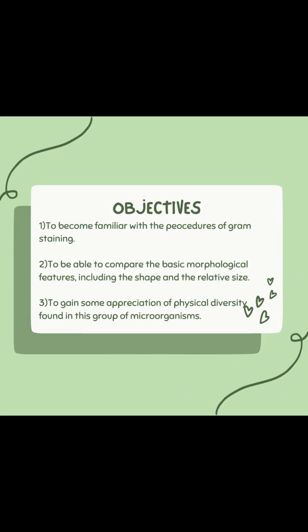Objectives of this experiment: to become familiar with the procedures of gram staining, to be able to compare the basic morphological features including the shape and the relative size, to gain some appreciation of physical diversity found in this group of microorganisms.